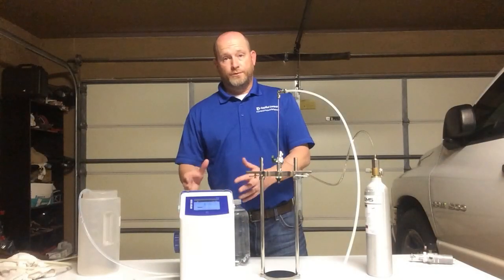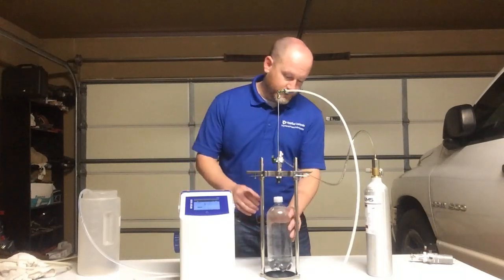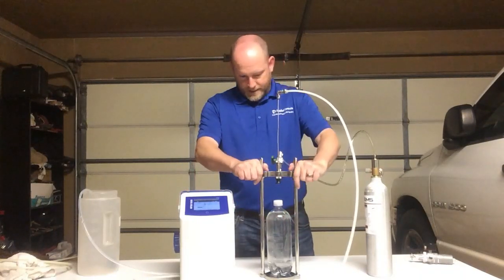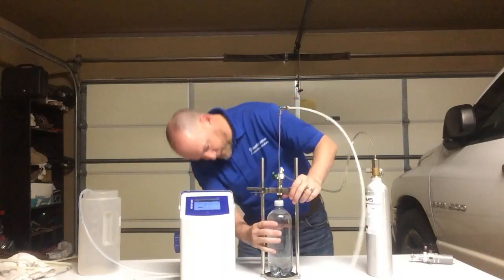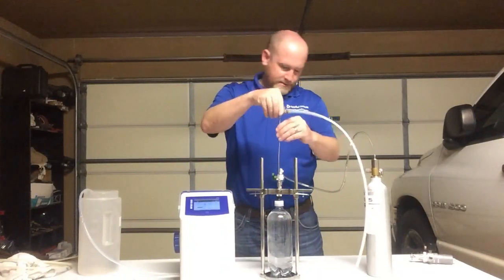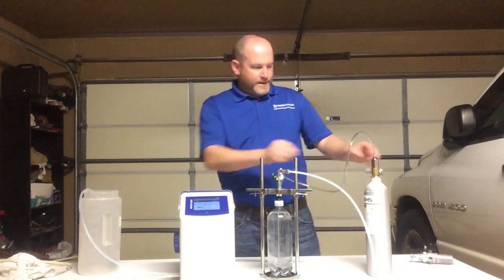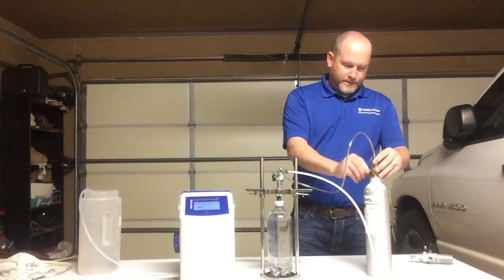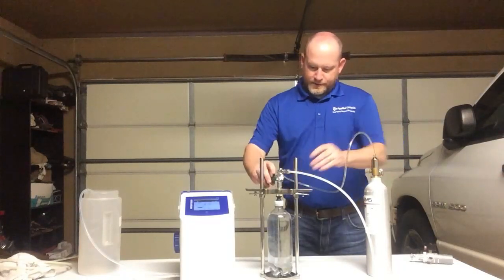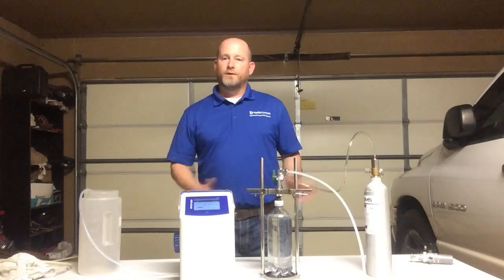Once you're done using the DO meter, you definitely want to make sure you clean it out. So what we do, you want to flush it with some warm water. So again, I'm going to use my can piercer on this. Make sure I get sealed on this can or this bottle of warm water. I'm going to have this all the way down. I'm going to turn my nitrogen bottle on, and I'm going to sit there and flush that with warm water. That way we're getting all the beer out of there.